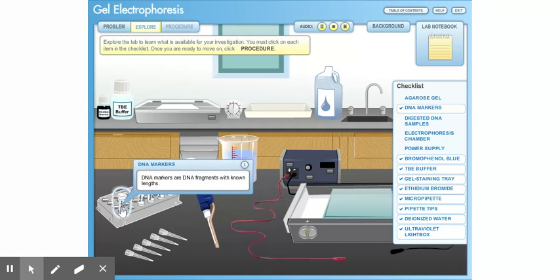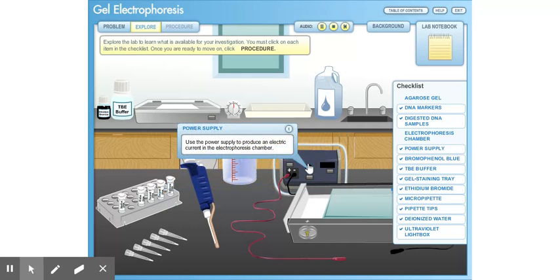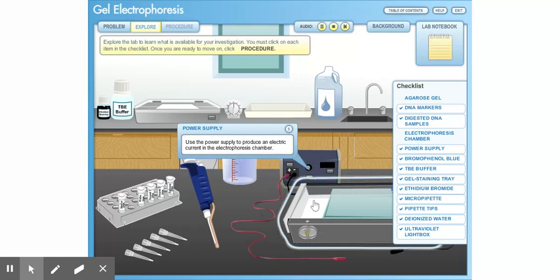DNA markers are DNA fragments with known lengths. Four DNA samples have already been cut into fragments by restrictive enzymes. Use the power supply to produce an electric current in the electrophoresis chamber, where electrophoresis takes place.